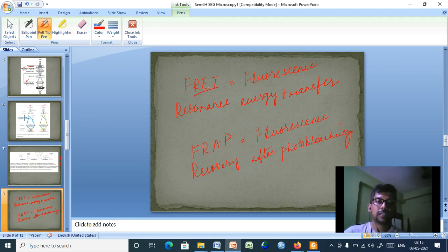Now please consider this one, fluorescence resonance energy transfer.